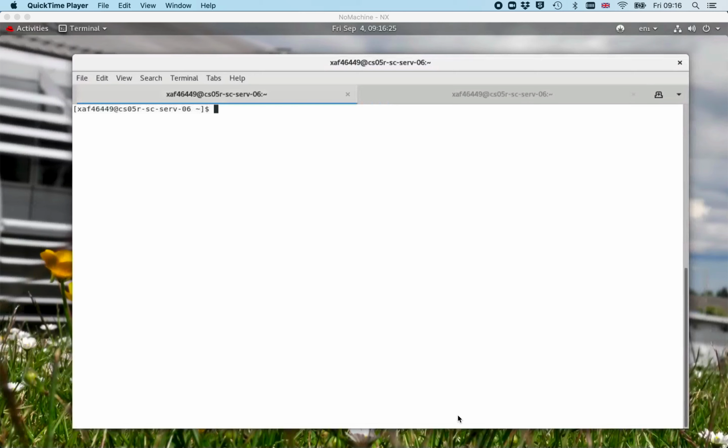I usually make these videos on my laptop, a Mac laptop. This time, for a change, I would actually use NoMachine to open a sort of virtual desktop on the cloud at Diamond to do the data reduction remotely. This makes a lot of sense for HPLC data because you tend to end up with hundreds and thousands of DAT files, and it's maybe a pain to transfer all of those files back to your local computer. If you can do the data reduction on a machine at Diamond, then you can just take the one or two processed files that you need.